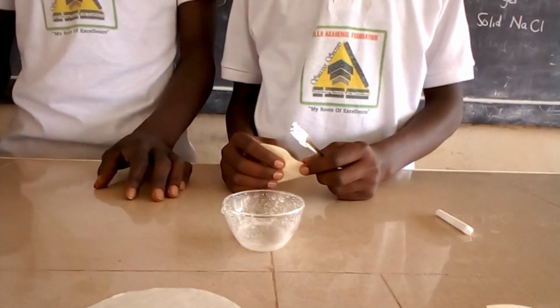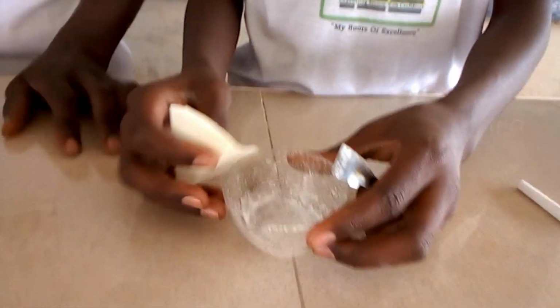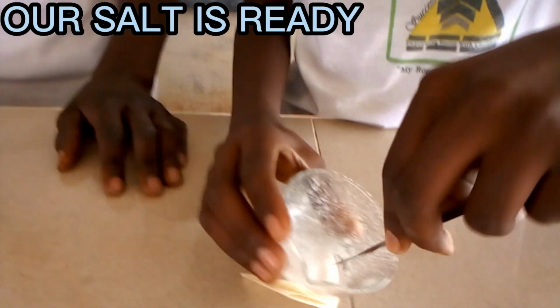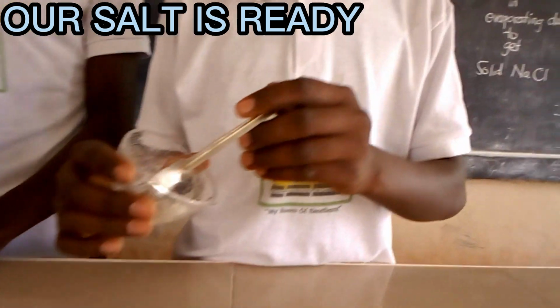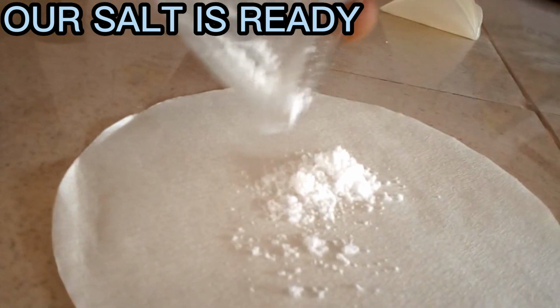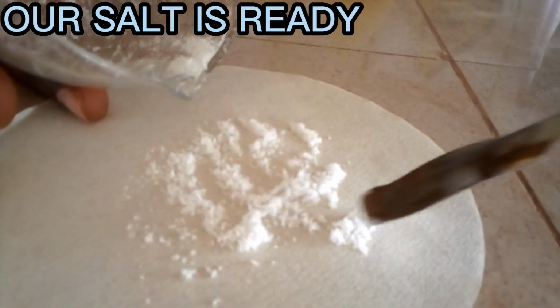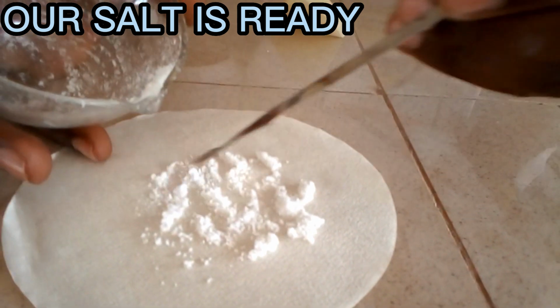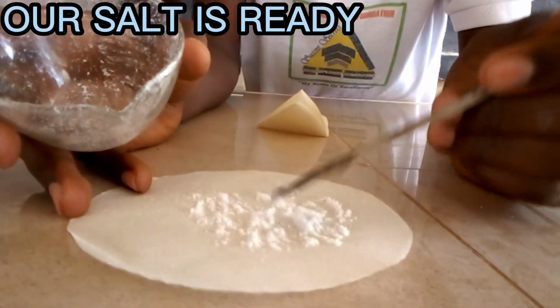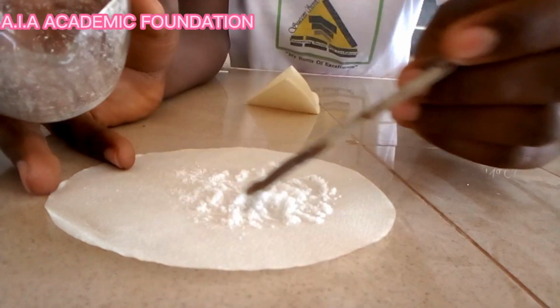As you have seen, the evaporating dish has cooled, so we shall now remove the crystals using the clean spatula, as my friend is doing. From the evaporating dish, we shall put them on the filter paper. These are crystals of sodium chloride, known as common salt, that we normally use in our homes. This is the common salt that we use in our homes for dining or adding to food.